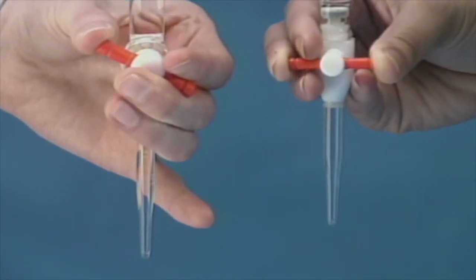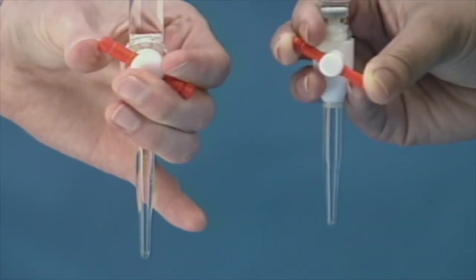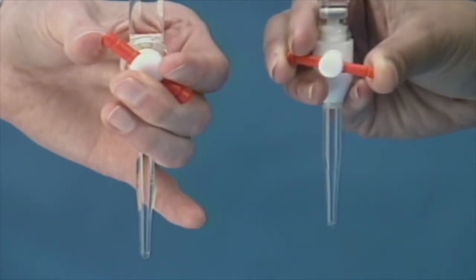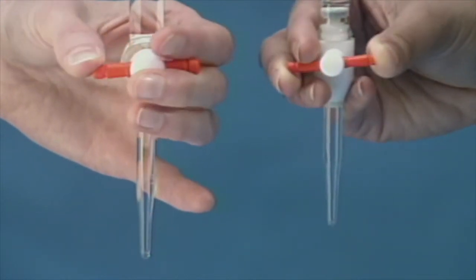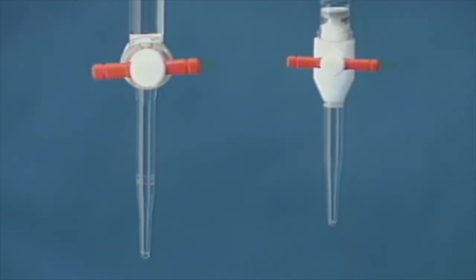The stopcock is fully closed when the handle is horizontal, but as shown here, there is a fairly wide range of off or closed positions, which vary from burette to burette.